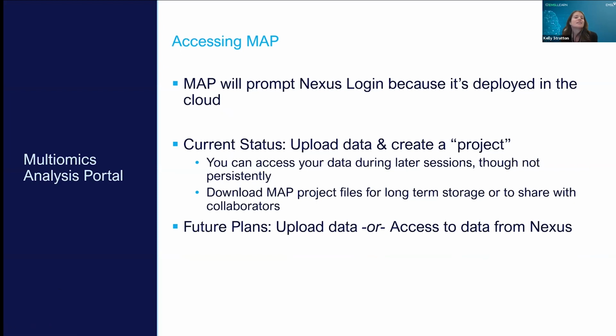Thanks, Lisa. So I believe that the link for accessing MAP has been dropped into the chat or will soon be. And when you go to that link, you will be prompted to log into Nexus, which is EMSL's user interface. And the reason for that is this deployment in the cloud. So you can request a Nexus account if you don't already have one. This is a free resource, but it is the way to access MAP.